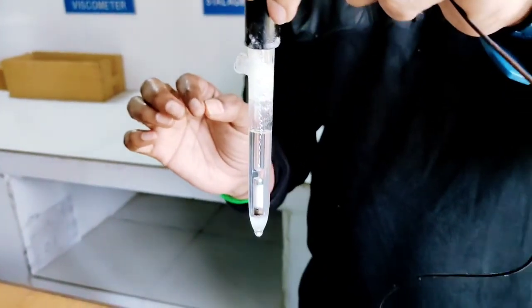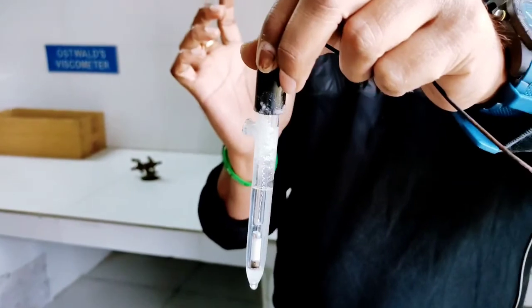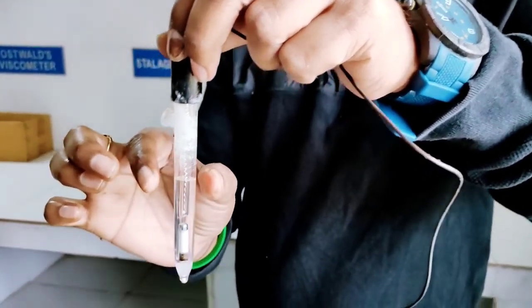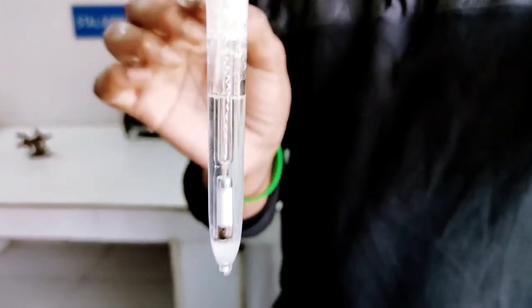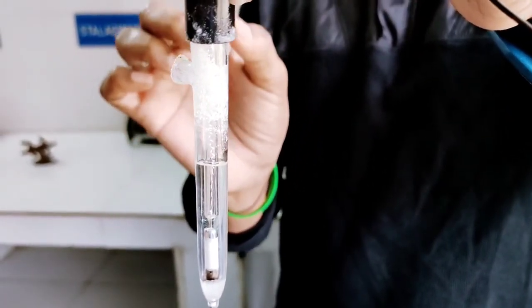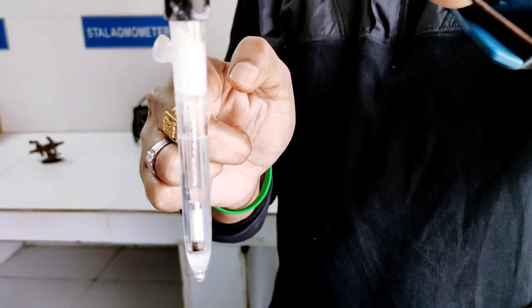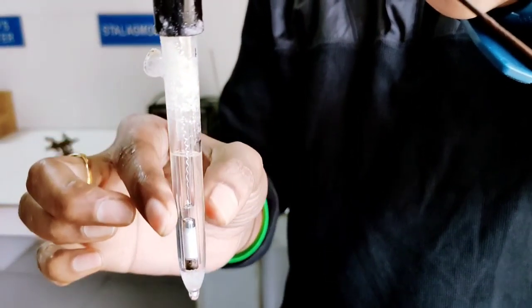Let us discuss how to construct the saturated calomel electrode. For the construction of the saturated calomel electrode, this glass tube is required for us. This glass tube, which is required for the construction of the saturated calomel electrode, in turn contains two glass tubes. The one is the internal glass tube and the other is the external glass tube.